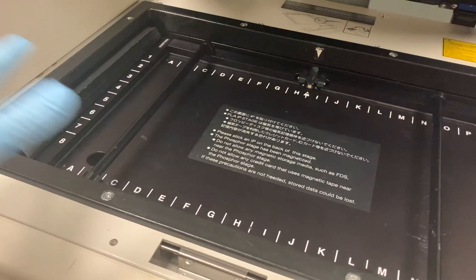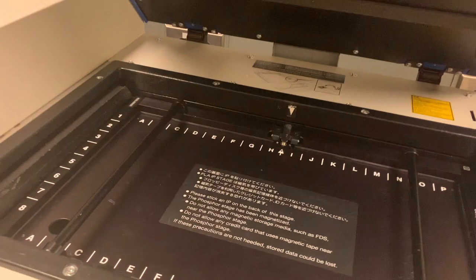This is a Typhoon scanner. You can put phosphor storage screens on it for radioactive scans — those screens capture the radioactive signal from your gel or blot, and you scan to see where the radioactive things were. You can also put in a fluorescent tray for fluorescent scans, such as if you have a SYBR Gold stained gel.